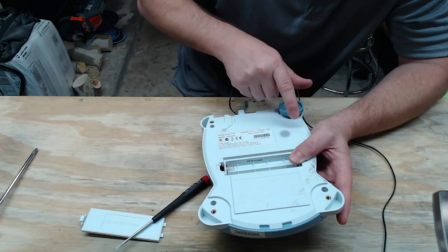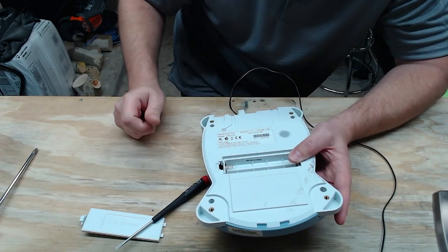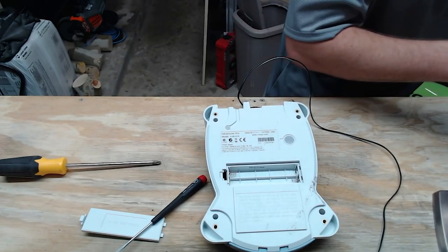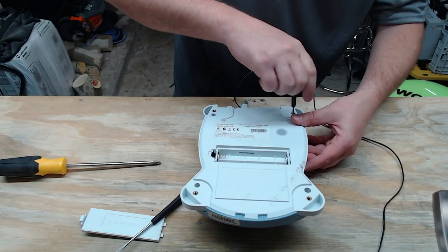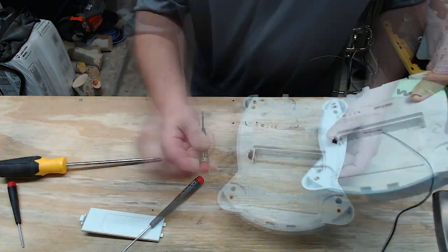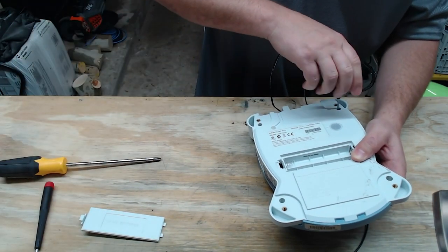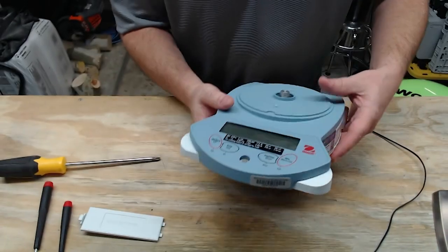One common issue is that users tend to lose or break the leveling feet, so if you're ever turning in a scale because something broke, try to keep the feet — you'll need them later. Another common problem is users leaving batteries in the scale long-term. If you're running off an AC adapter, there's no sense having batteries in it. This scale had an error code on it, which is probably why it ended up in the disposal bin. We're going to look at the load cell and see if we can figure out what's going on and get it back up and running.